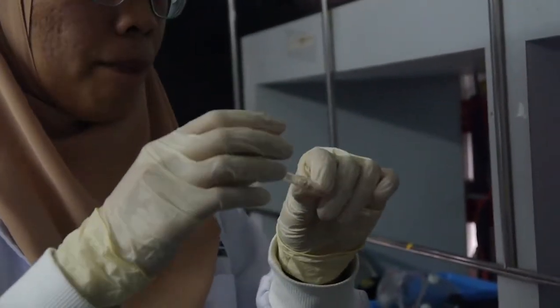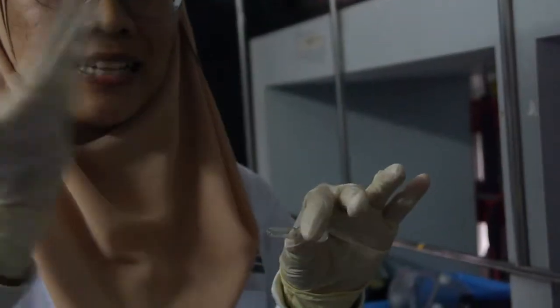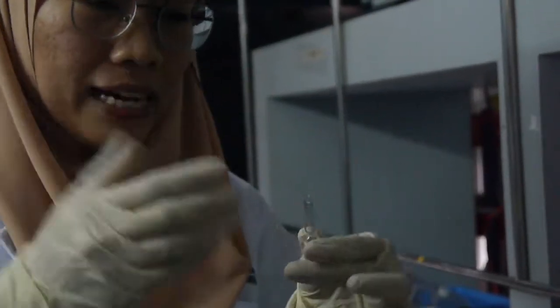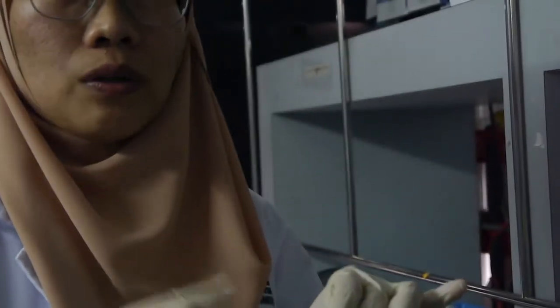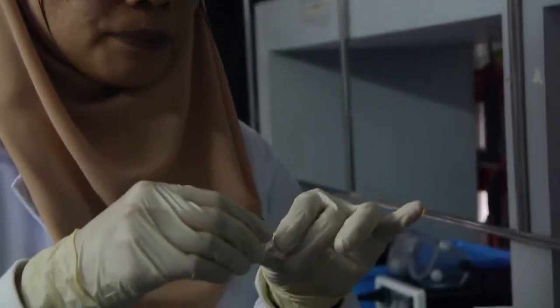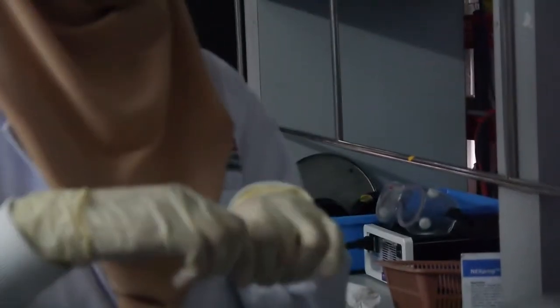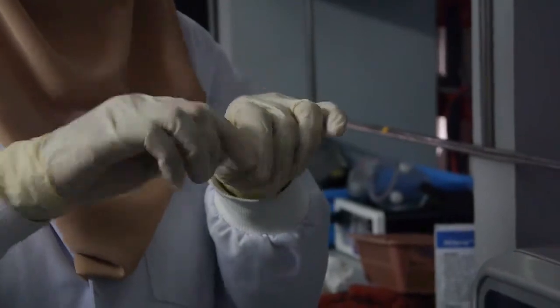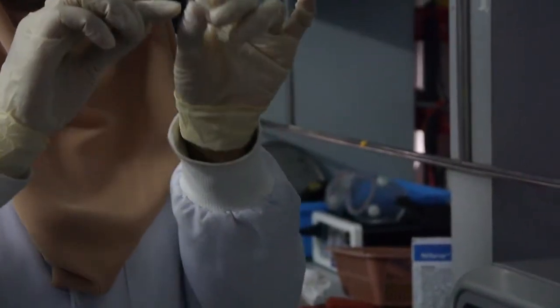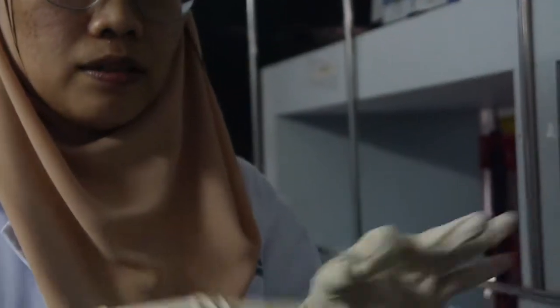First, to avoid the glass pieces going onto the body. Okay, pieces of the glass could go to your eyes or the culture. So before that, you need to spray the... The culture is at this area, and once you break it, the culture will be spread near your body, your eyes.